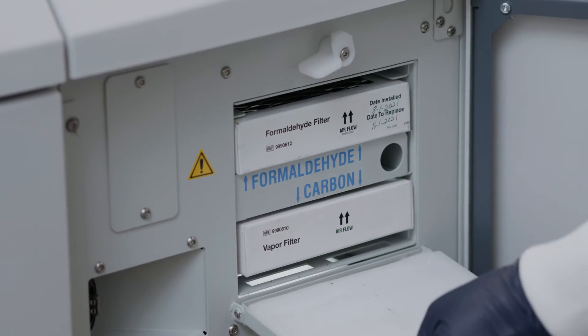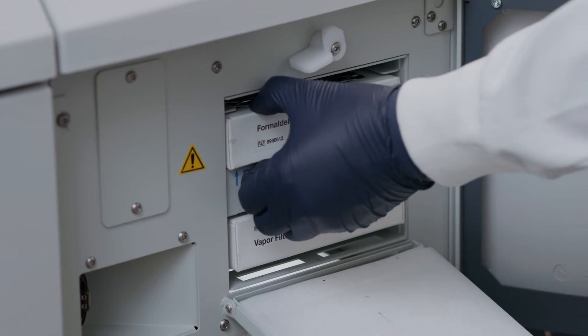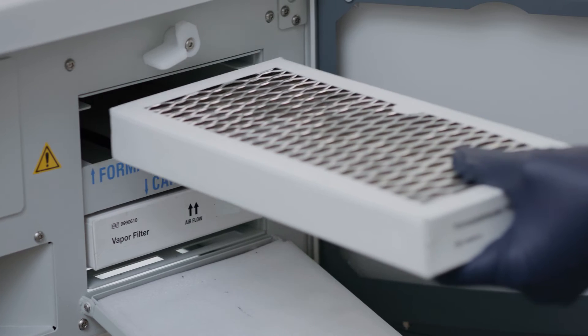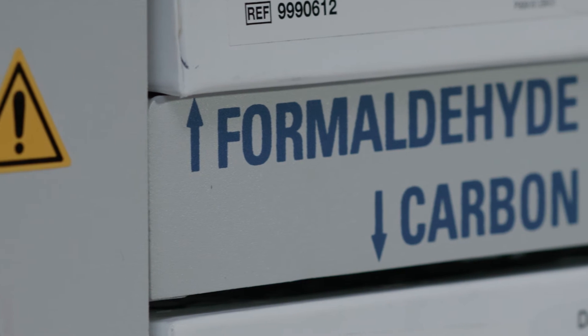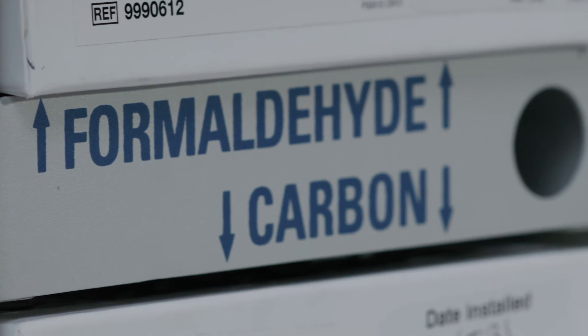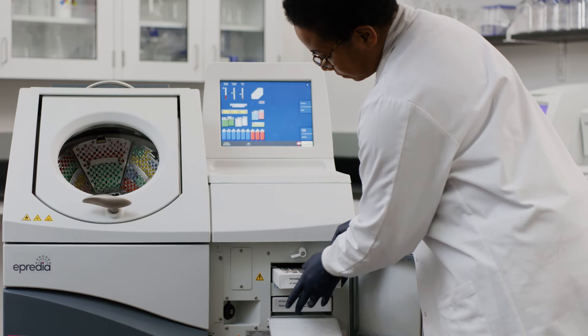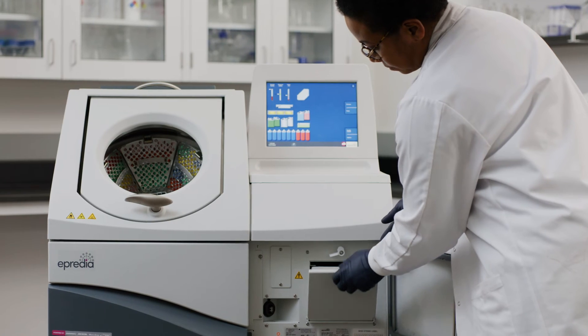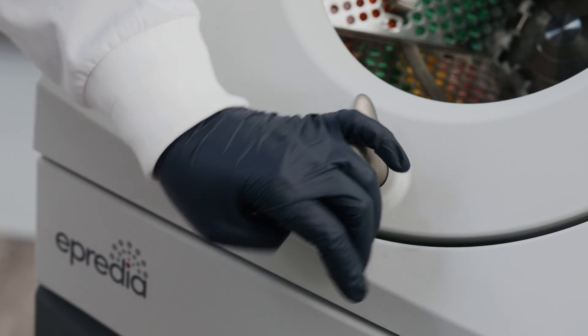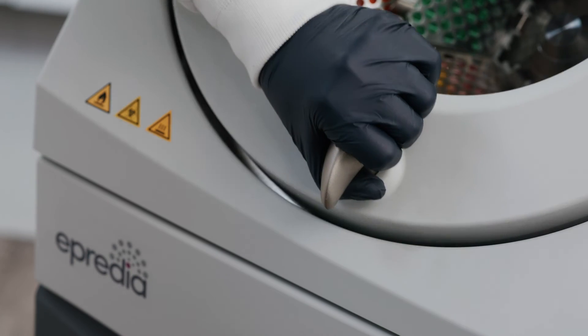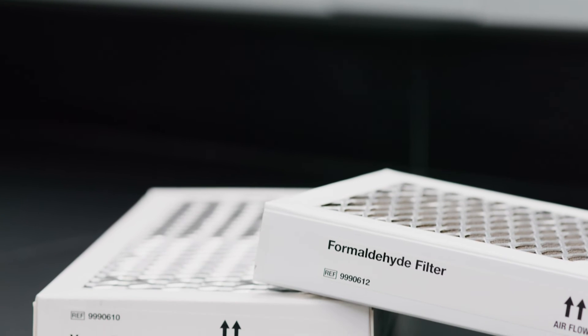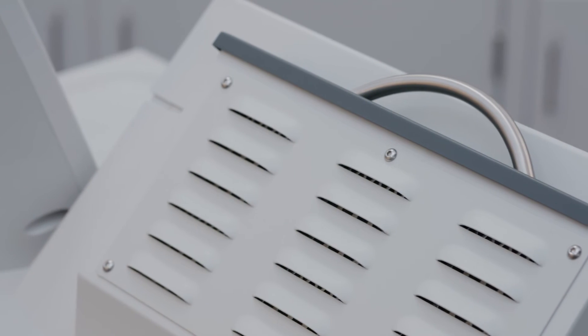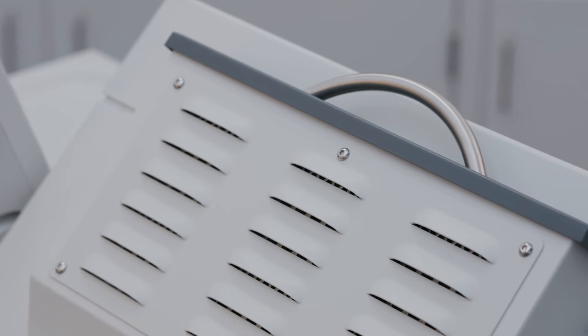As the only tissue processor on the market to offer triple filtration within the chamber and reagent cabinet, the Revos Rotational Tissue Processor's enhanced safety features help protect laboratory staff from harmful fumes. Its downdraft ventilation technology activates automatically within the reaction chamber when the handle is turned, and the potassium permanganate and carbon dual filtration system keeps toxic fixatives and solvent fumes within the reagent storage cabinet. This filtration system navigates harmful chemicals away from your personnel for increased safety.